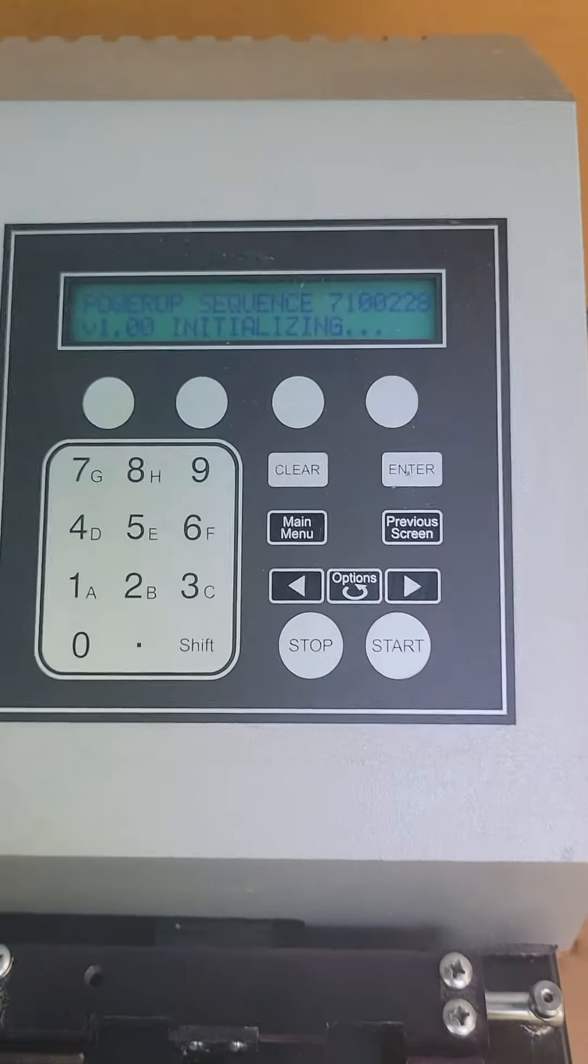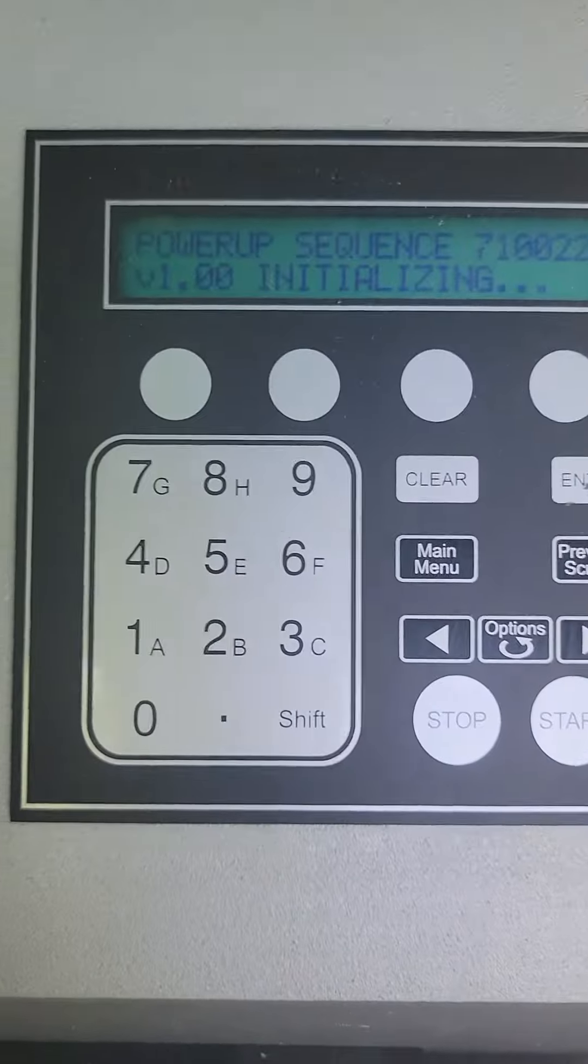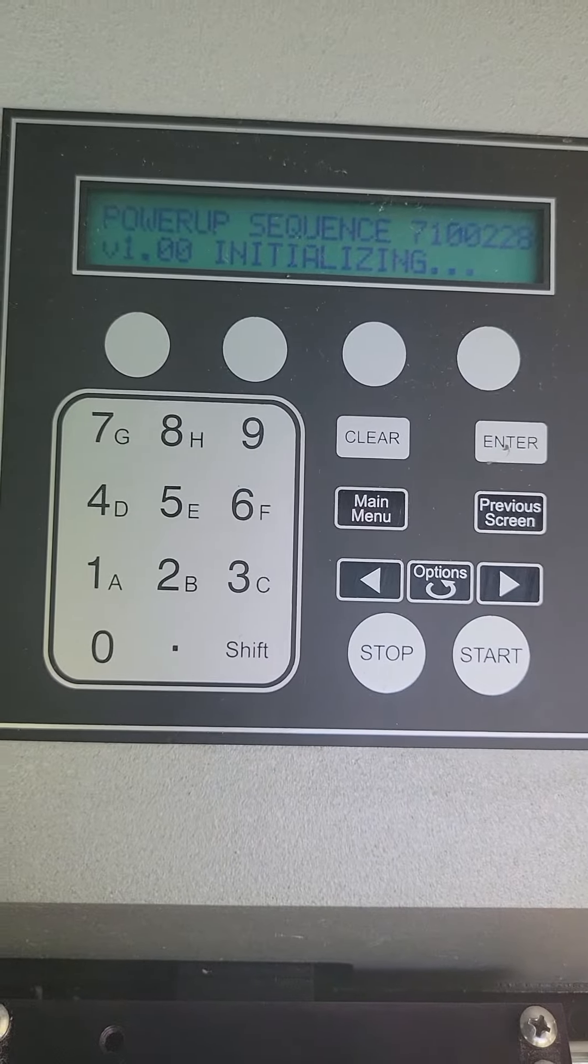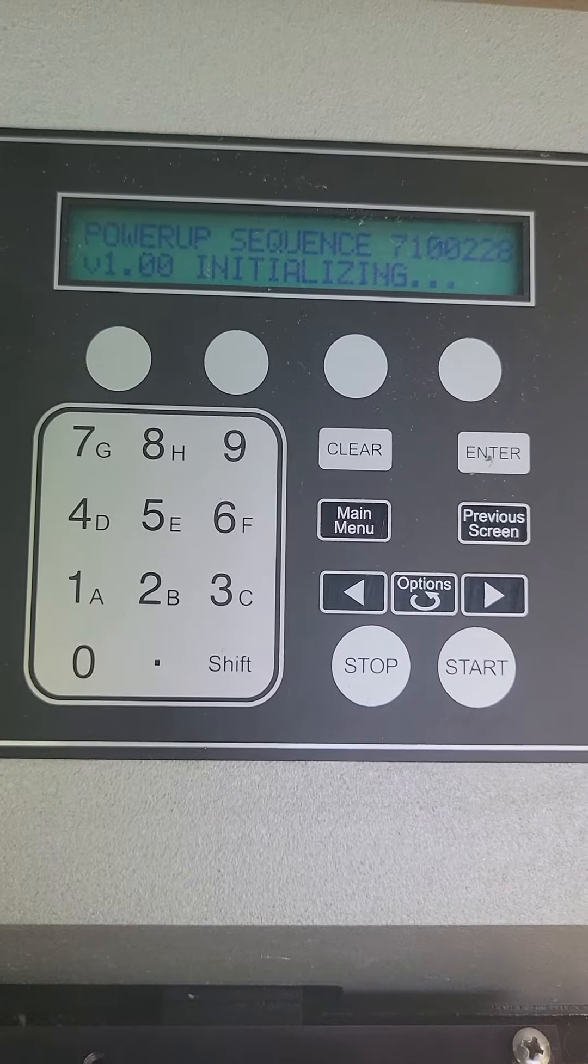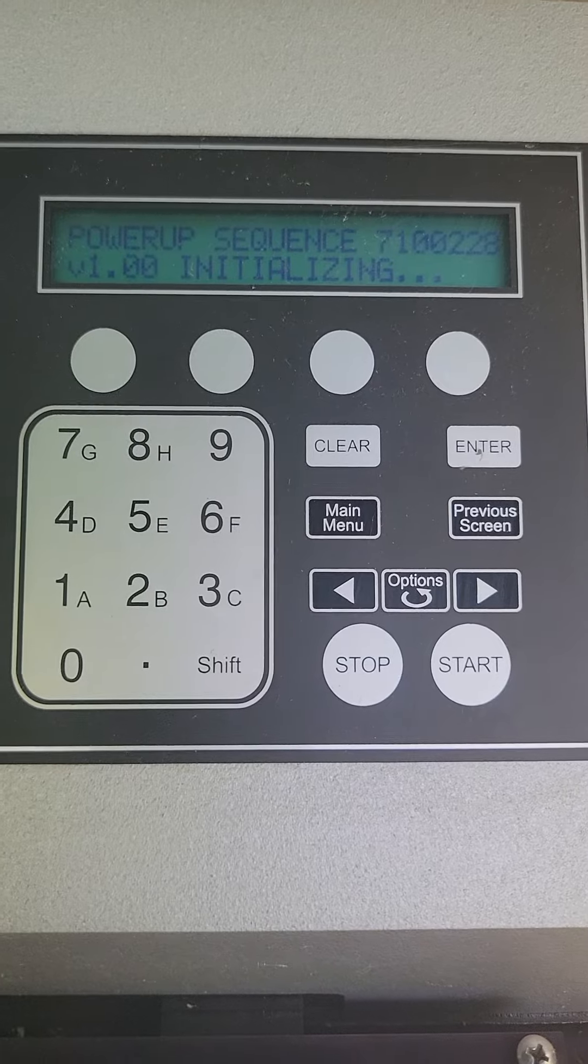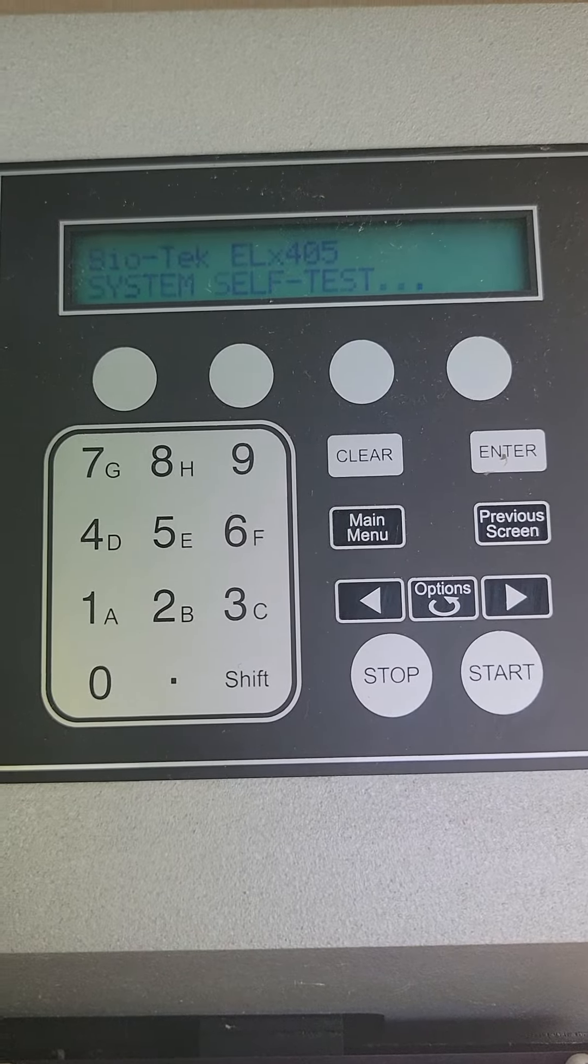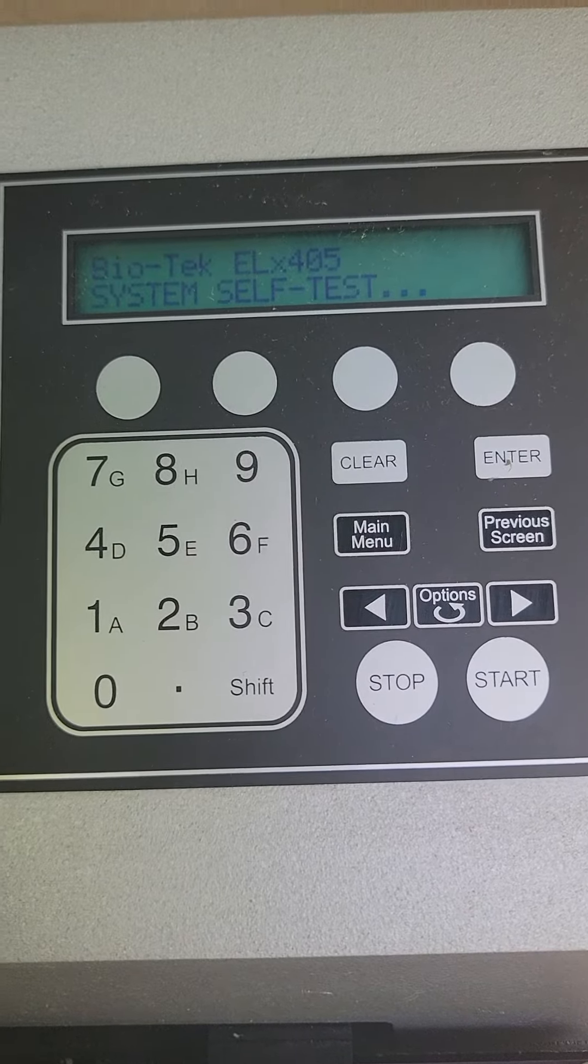Power it up. You immediately see it goes through the motions and it's really nice.